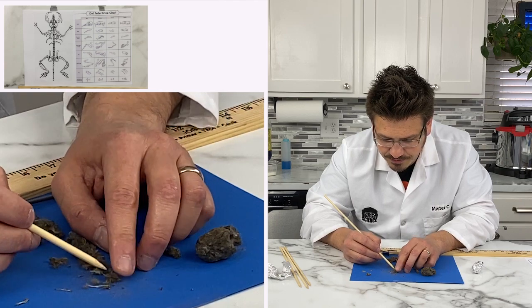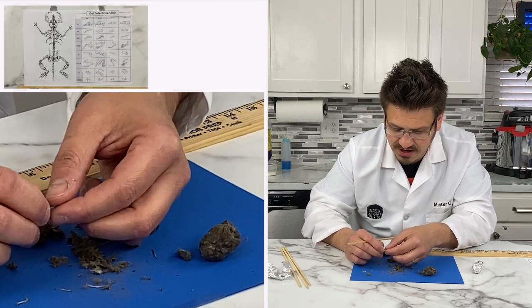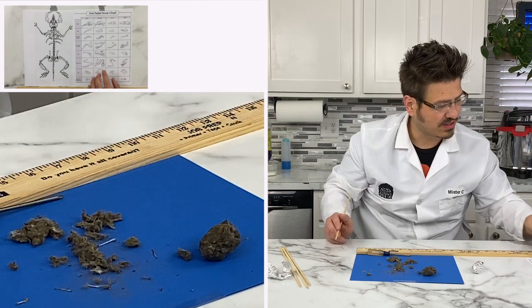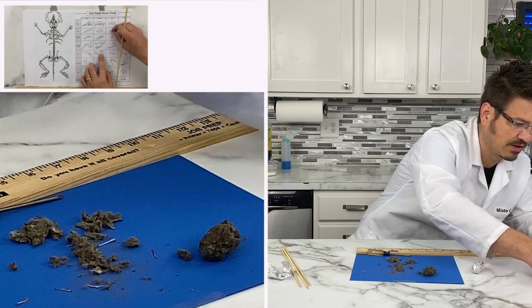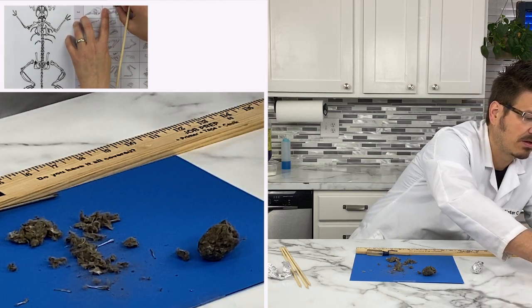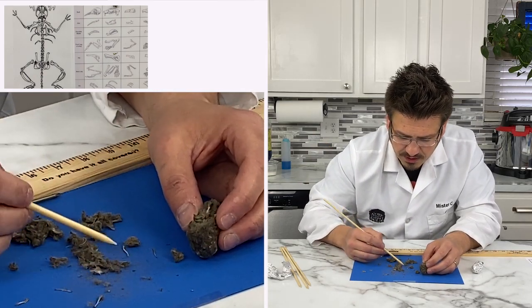Bless you. I think it's maybe missing. Ooh. I think I just found a hip bone. I'm going to set it over here. Let's try to zoom in on this one just for a second. We stay kind of zoomed in. Can you see that? So we've got ourselves a little mouse bone. If we need to adjust the cameras, we can get them closer. If we need to put it right here in the shot, we can. Do you want to do that? You want to bring this camera down? No, I think we're okay. All right. I think we can see the hip bone.